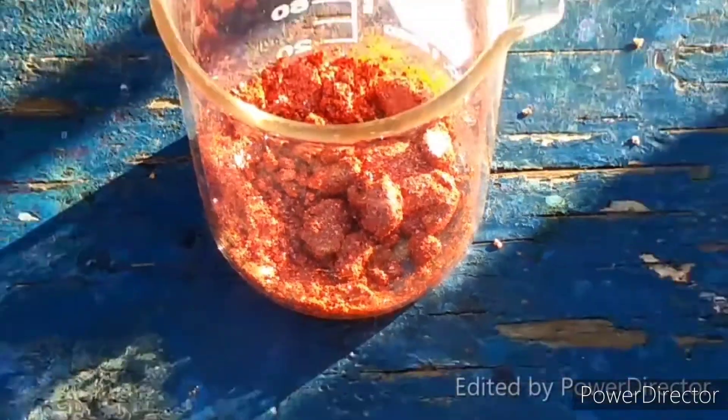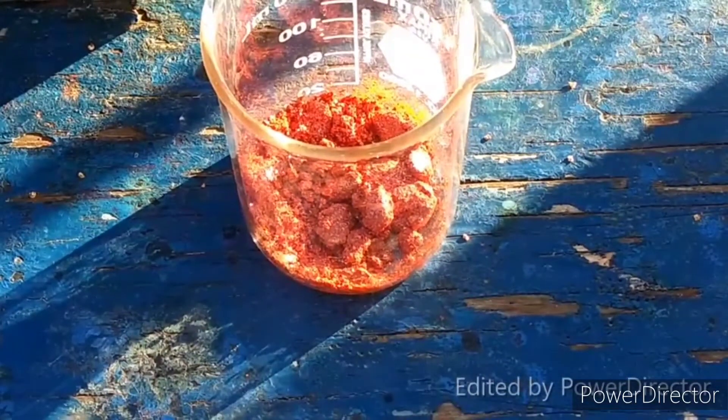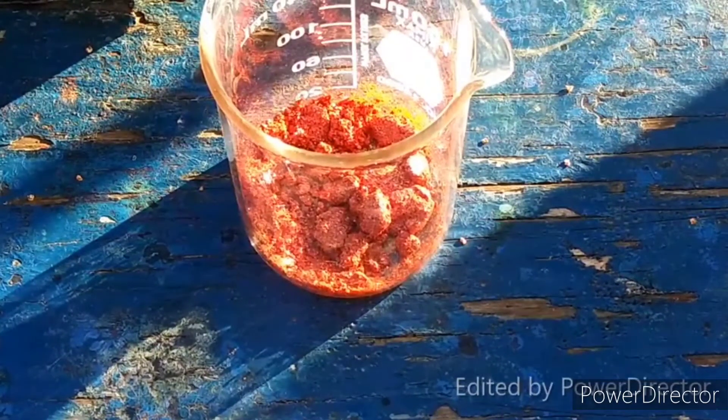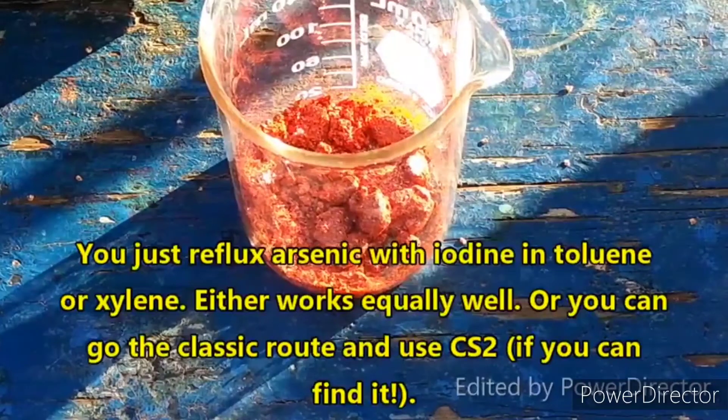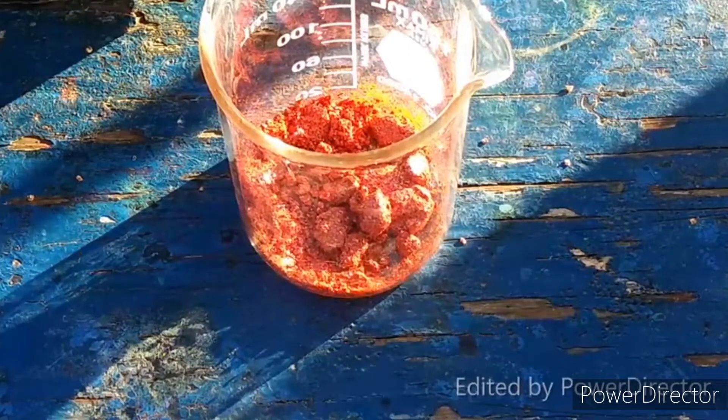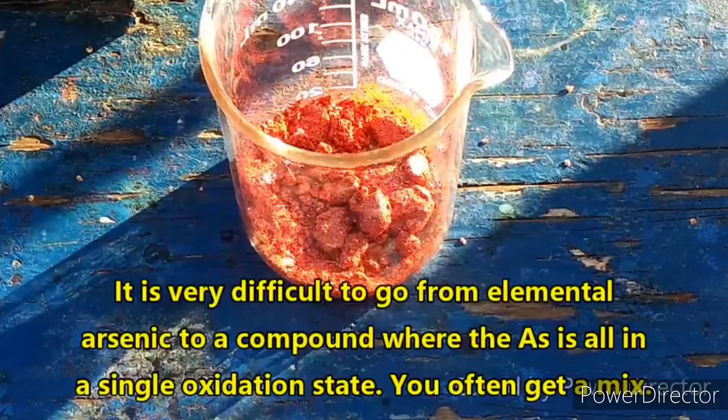So this is arsenic triiodide and I settled with this because one, I know how to make it and it's very easy to make, just like antimony triiodide. And number two, I know the arsenic is in the plus three oxidation state, so there is no question about oxidation states in this particular compound.